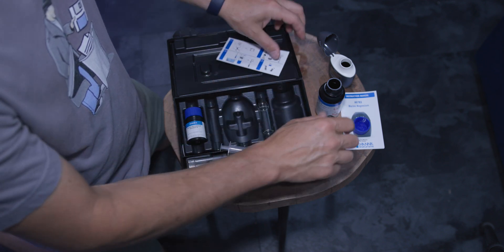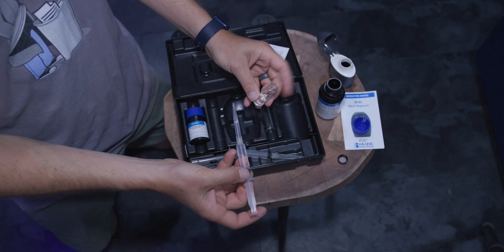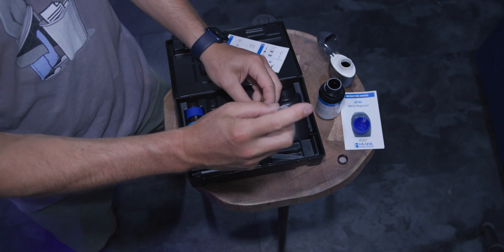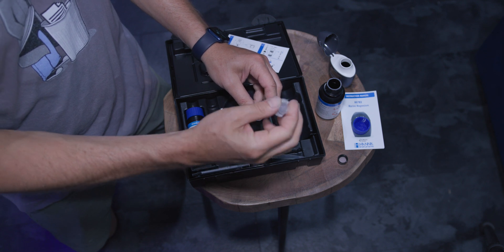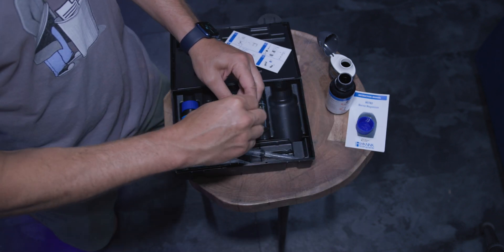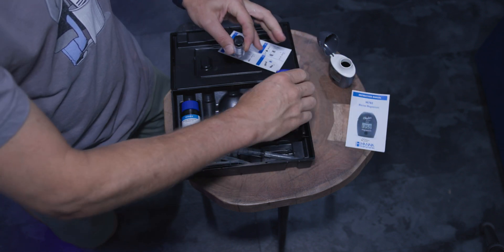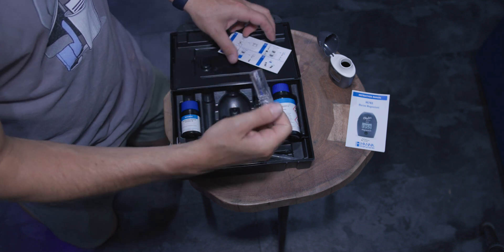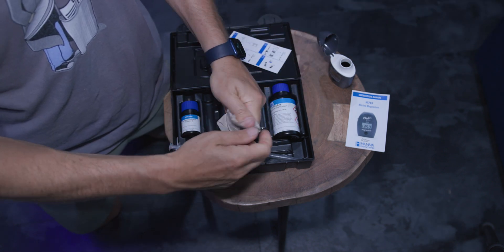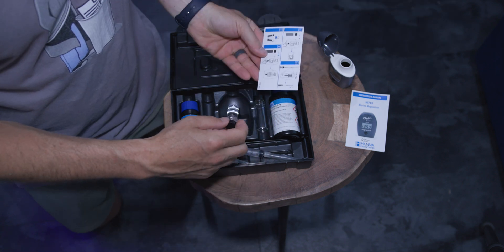No shaking. Five mils of sample water. All right, I'll go get that. Got my five mils of sample water from my tank. Got a good hold of the cuvette. Can't tell you how many times I've fumbled these and spilled out everything. When I'm running a test, sample water goes in. And try not to dump everything off my table. Tell you what, let's be smart and put the cap back on reagent A, just in case I get klutzy. Shake five times.